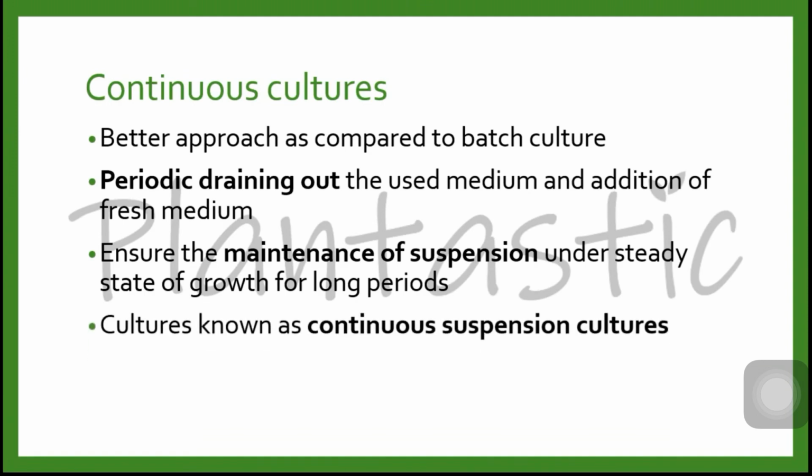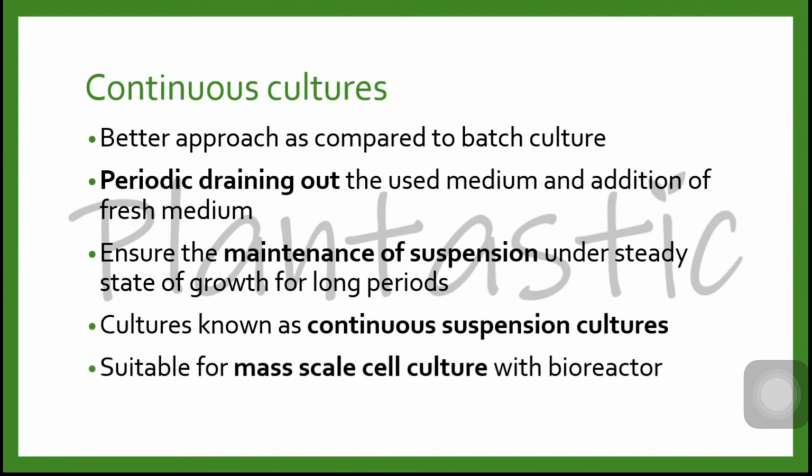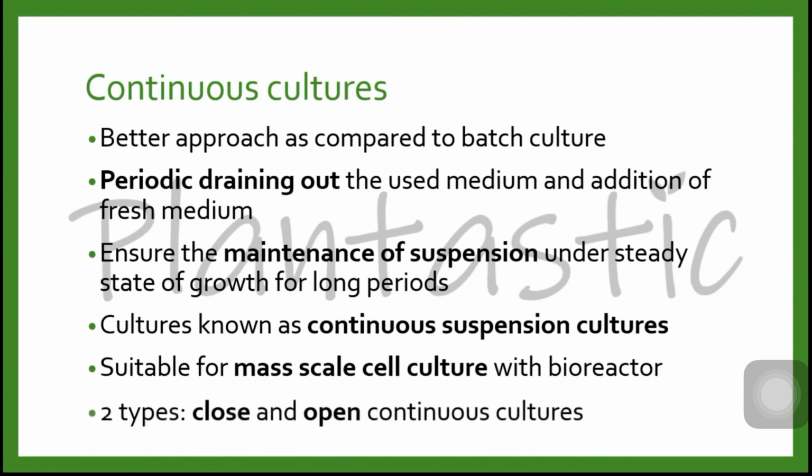The cultures are known as continuous suspension culture. It is suitable for mass-scale cell culture with a bioreactor. These continuous cultures are widely used in research and commercial settings. There are two types of these continuous cultures, which are the closed and open continuous cultures.